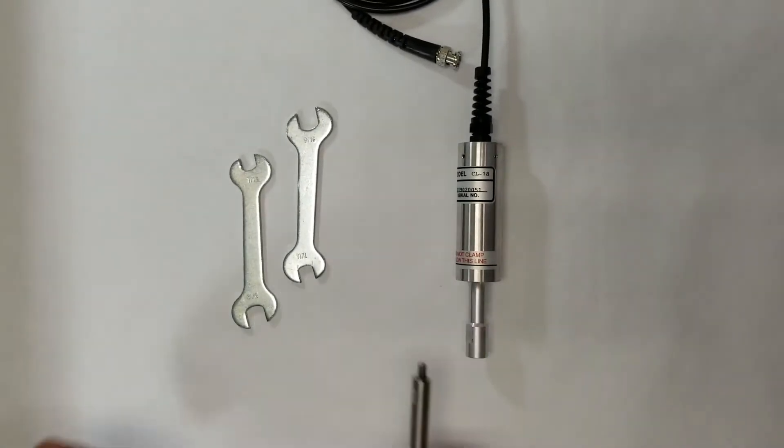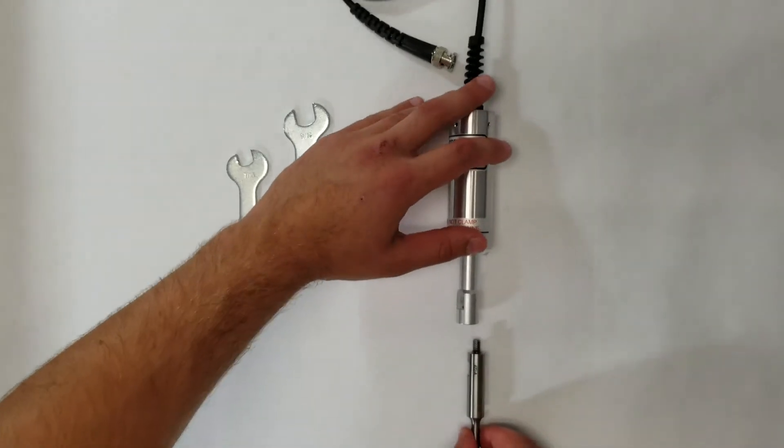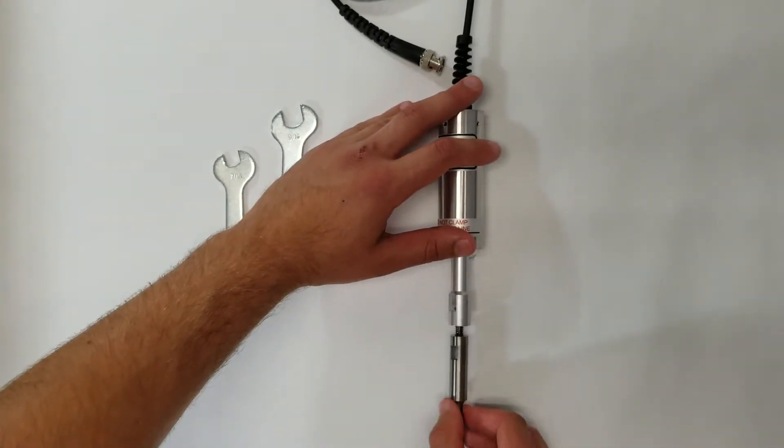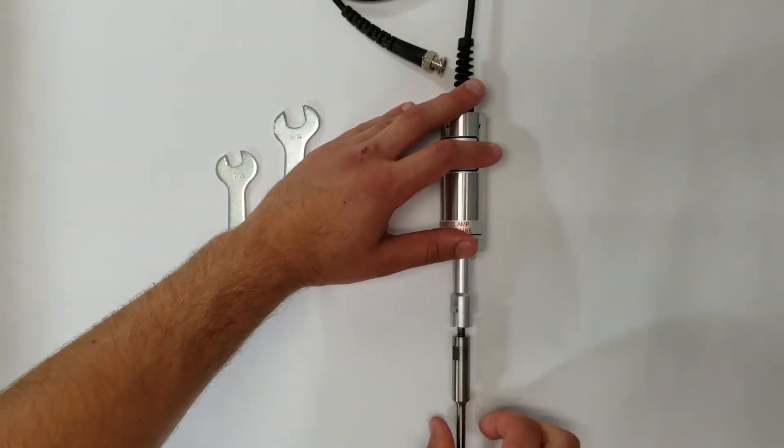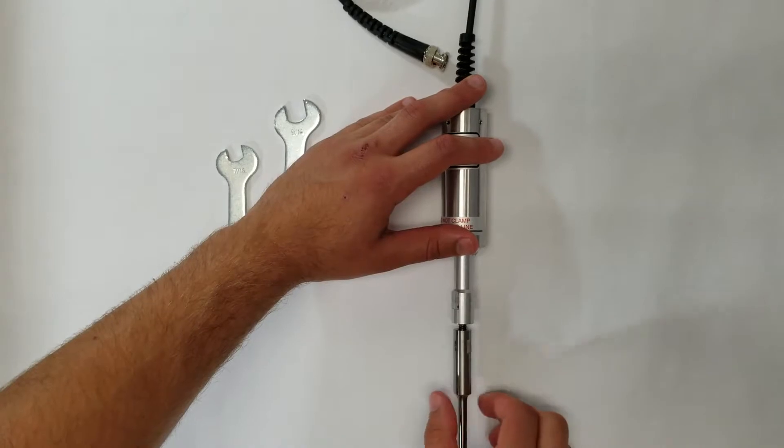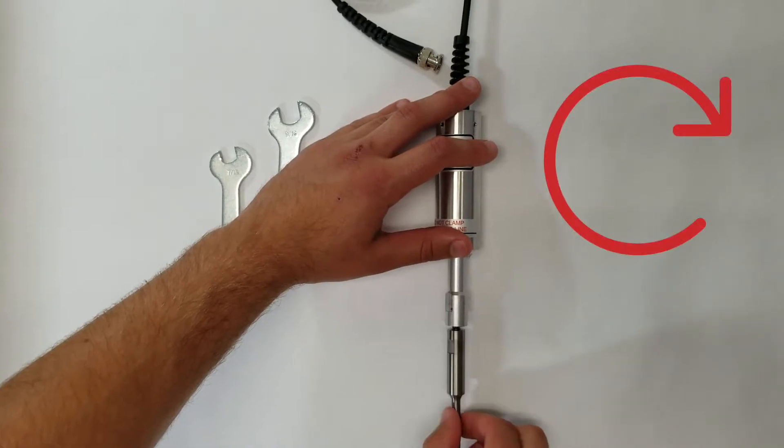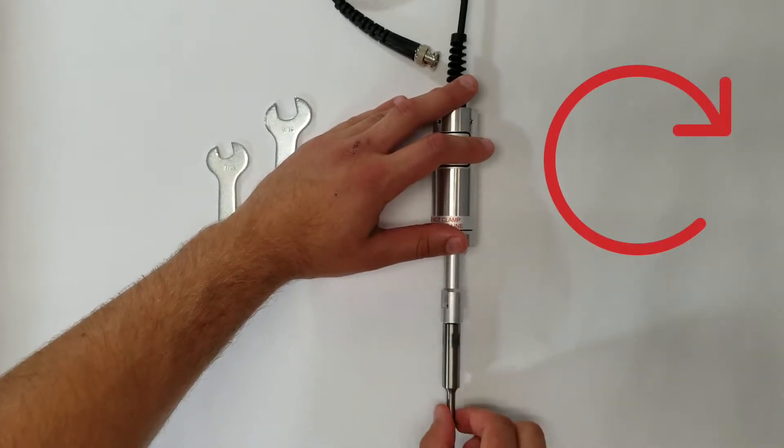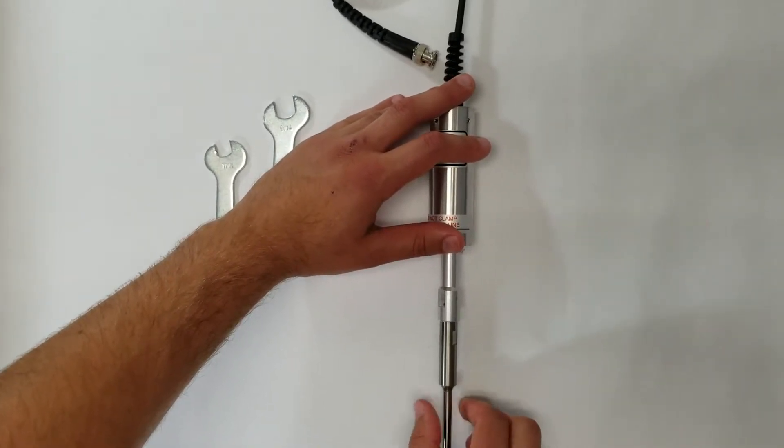To tighten the probe onto the converter, begin by hand-threading the probe stud into the threaded hole in the bottom of the converter. Rotate the probe clockwise—righty-tighty, lefty-loosey.